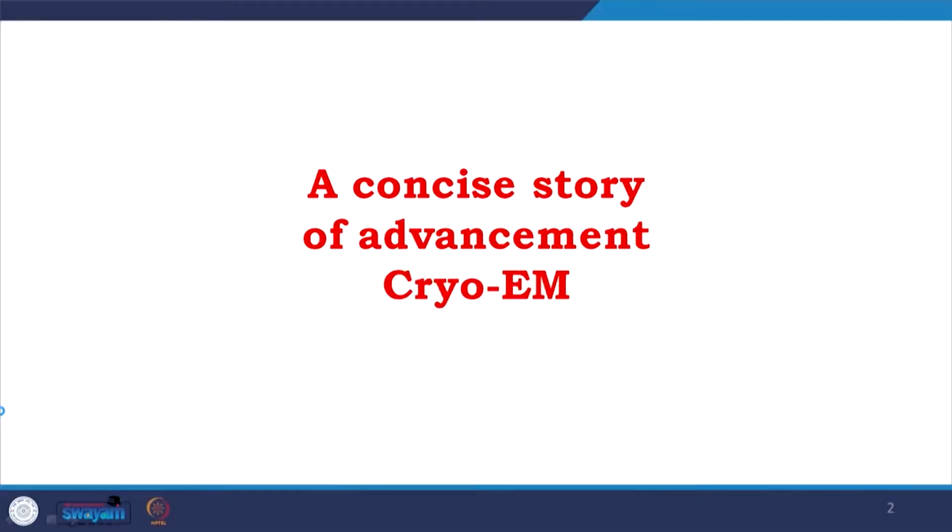Today, I want to summarize that in a form of a story. I hope you will like it, because cryo-electron microscopy among the 3 high resolution techniques is considered as the most potential one. How the technique has travelled, what are the challenges, what are the journeys, I am summarizing them in a way you could see how it comes up. So, a concise story of advancement of cryo-electron microscopy.